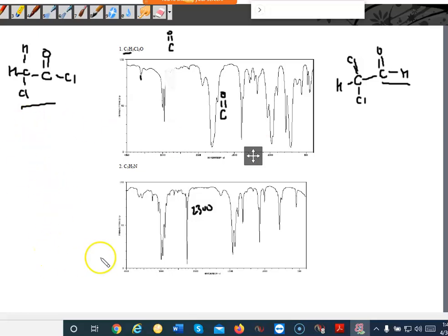Oh, yes. So there are actually 2 possible structures, just because this could be garbage or it could actually be a peak. Could be that I have a cyanide. So I have CH3, CH2, and a nitrile. This group there would be at 2300, and then here are my aliphatics. However, it could be that I do have an amine, and then this peak right here could be a terminal hydrogen on a triple bond. So this can also work as well.